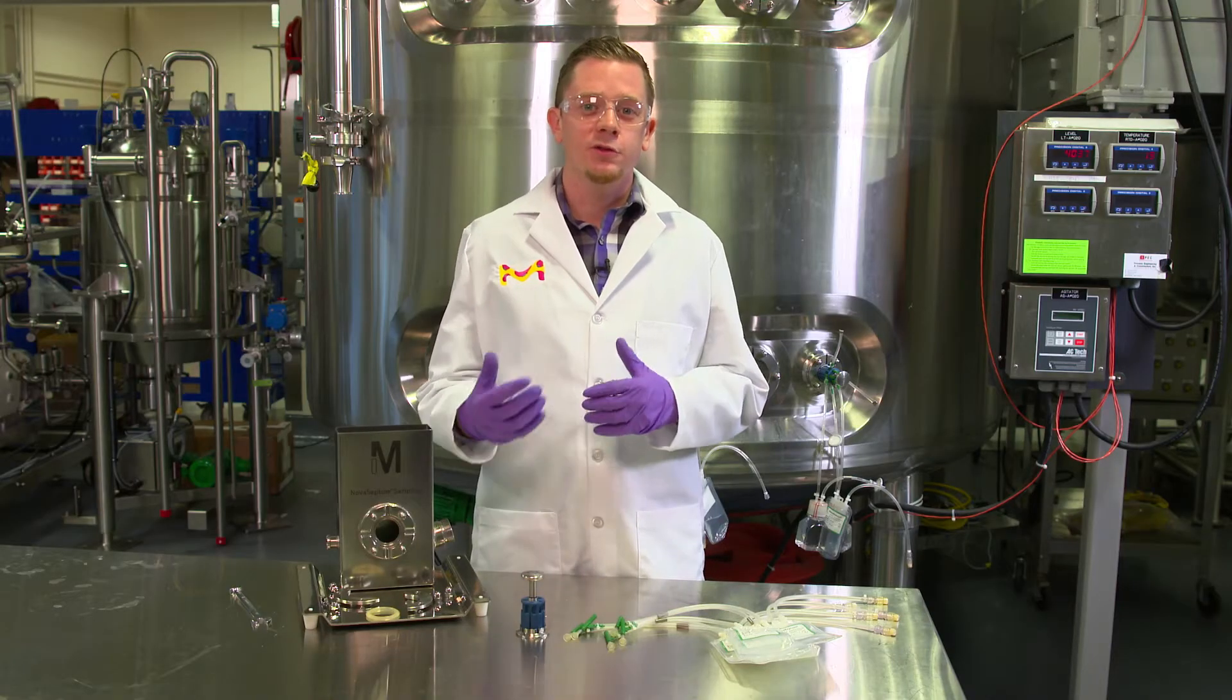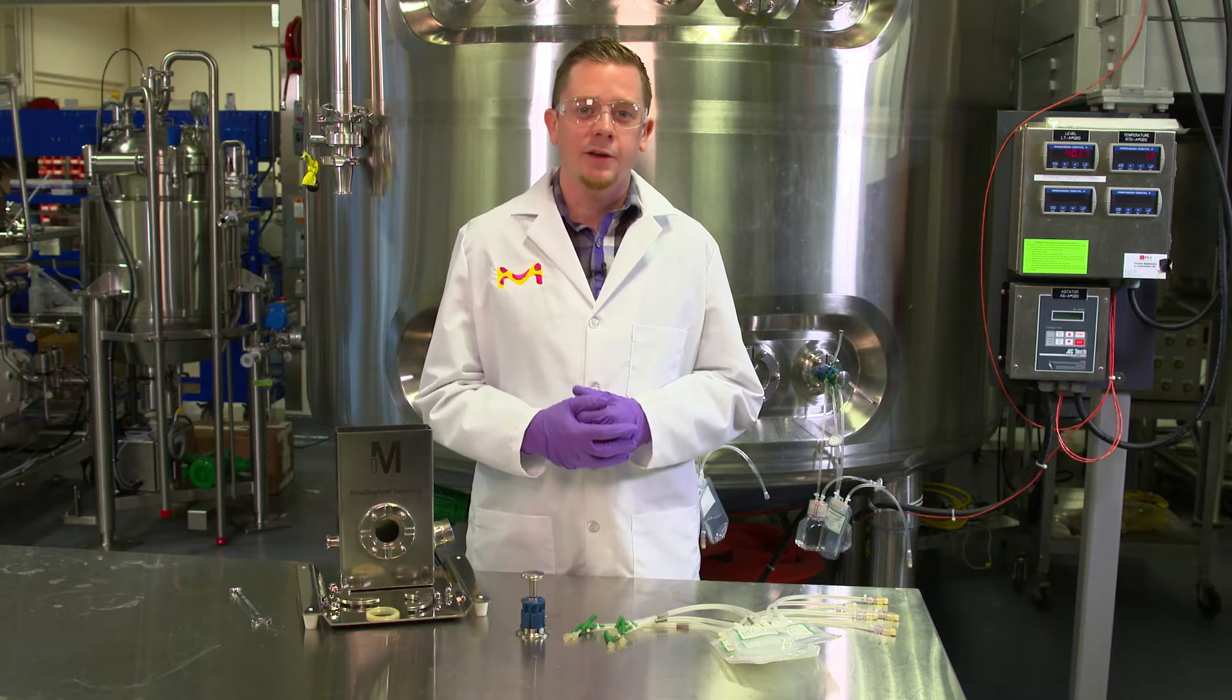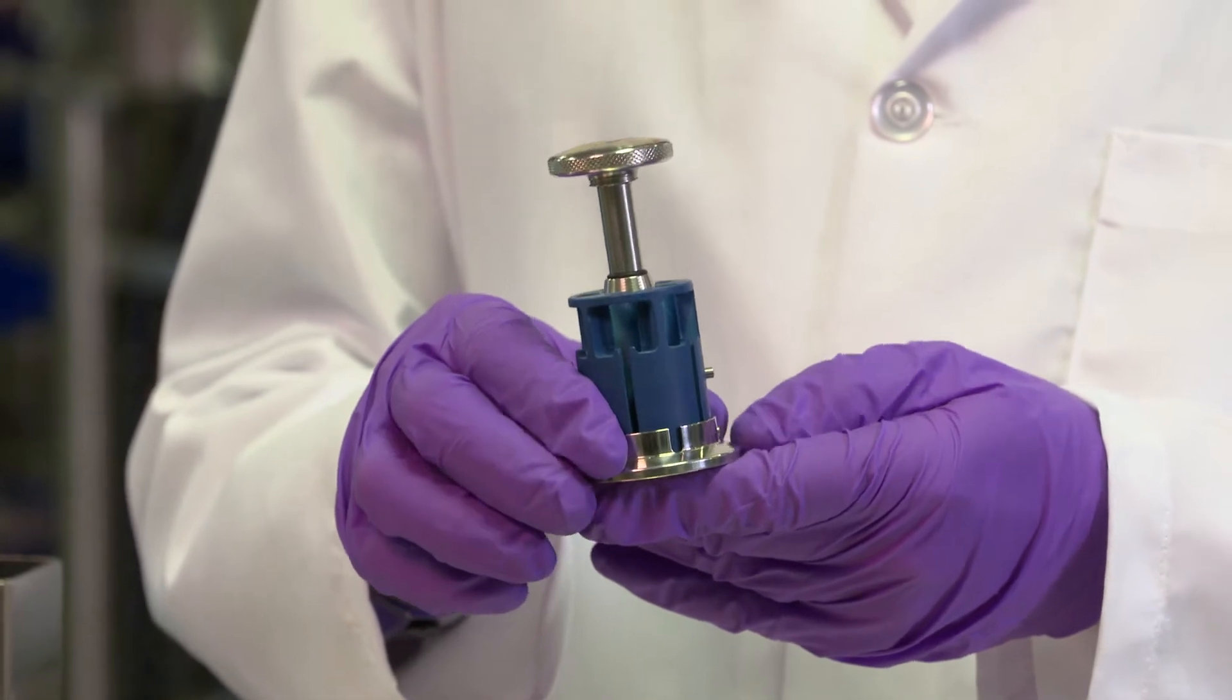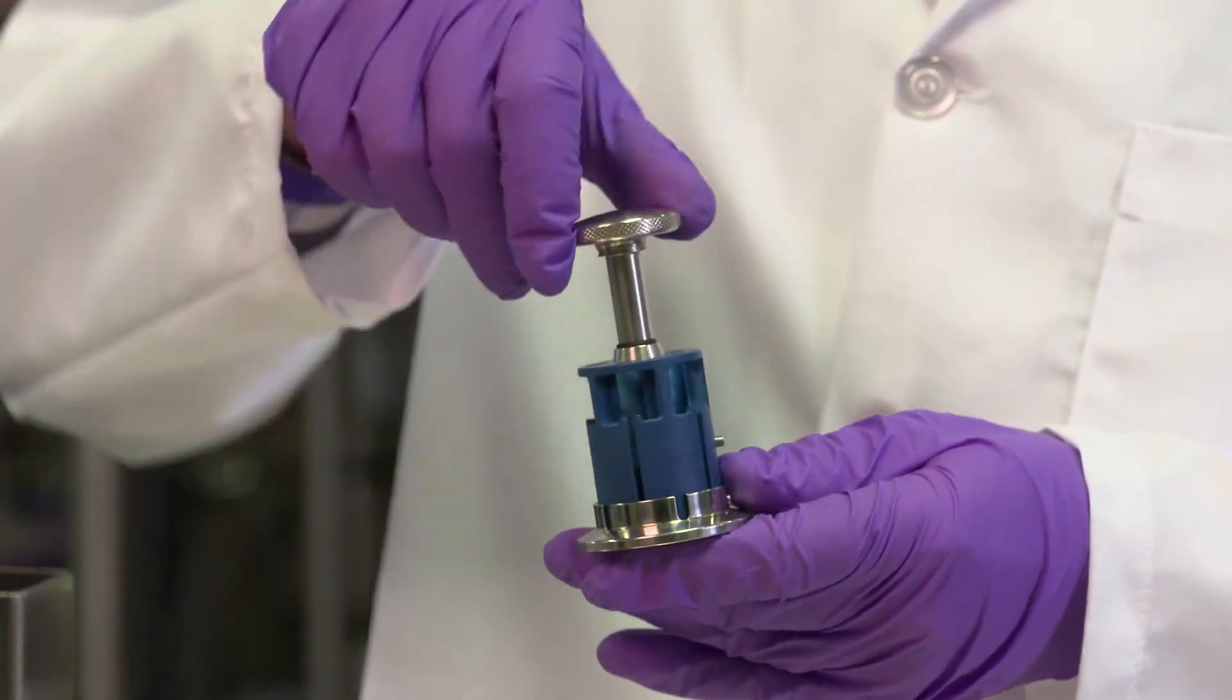So now let me show you how to install a sampling system onto a tank. The first step is to take our holder and disassemble it so that we can install the containers onto it.